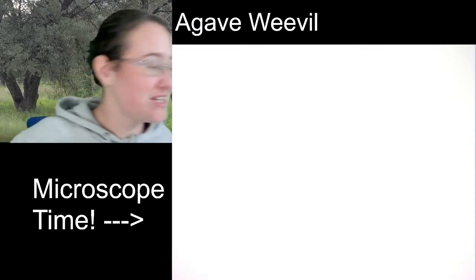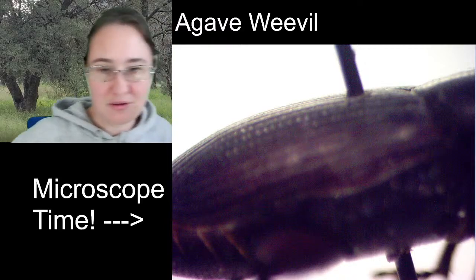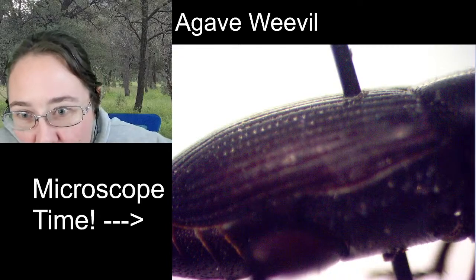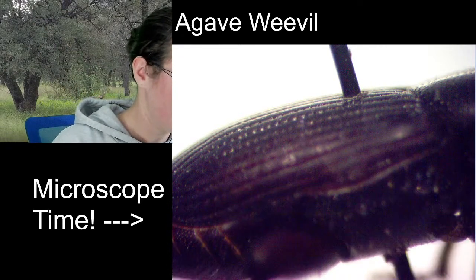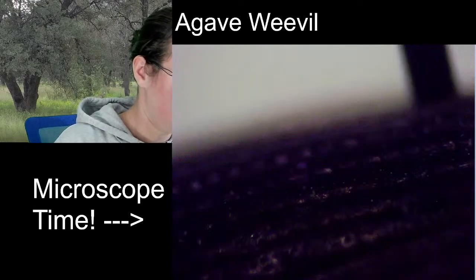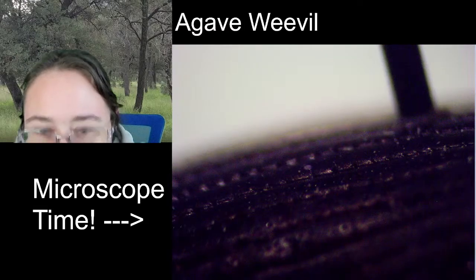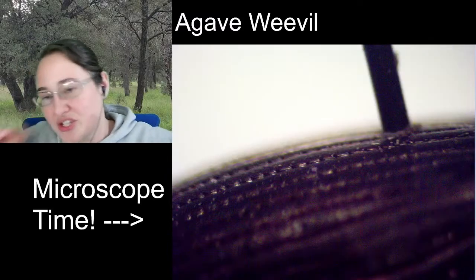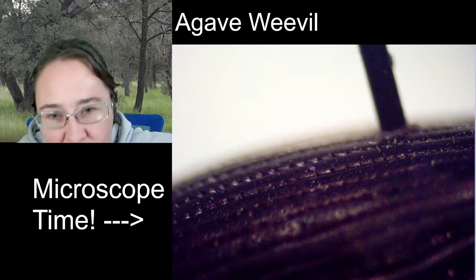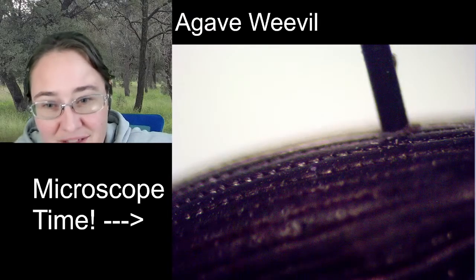Good observation on the organization of the dots. Thank you. And are there little hairs in the punctations on the elytra? I don't know. Let's go see. No. Some of the punctations appear to have maybe a little bit of dust or debris in them. But there aren't any hairs coming out over the distance. Good question.